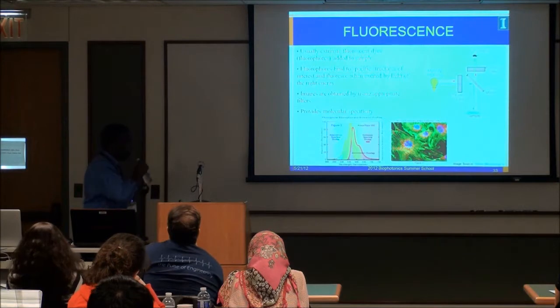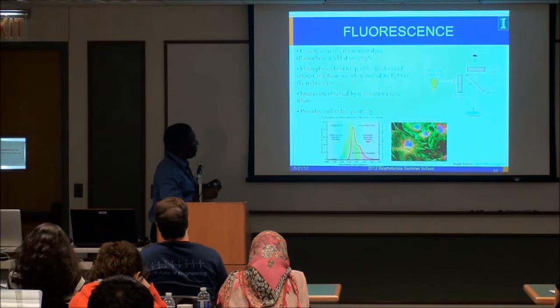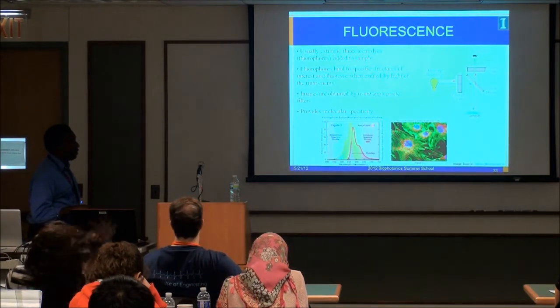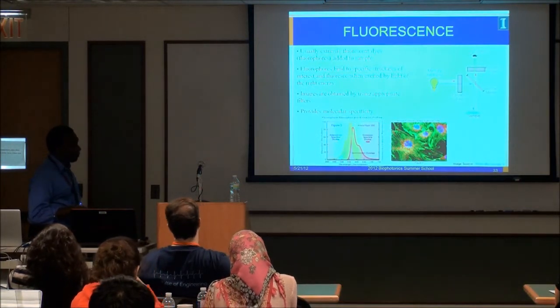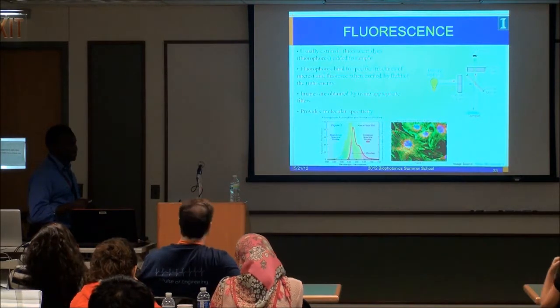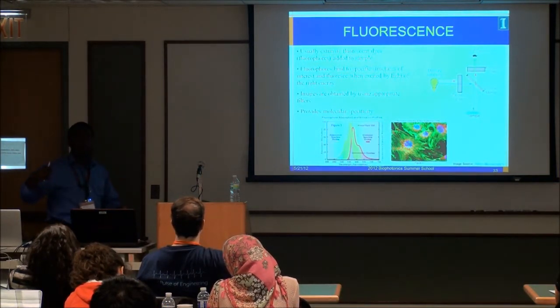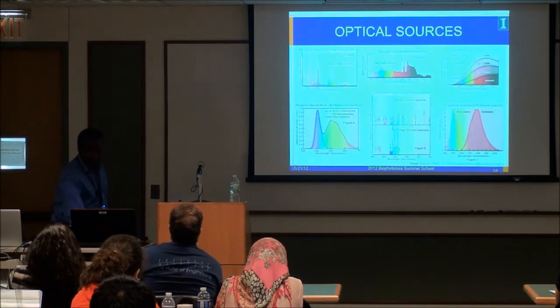So fluorescence microscopy is what typically gets used. I think everyone is pretty familiar with that, because I talked about it from the quantum picture. But you can imagine there are different fluorophores that one can use. They have a certain absorption spectrum, they have an emission spectrum. Typically you come in with energy that matches the excitation bandwidth of the absorption spectrum of what you're trying to excite. And the light that's coming off will be Stokes shifted because it's lost energy. And so you're going to have an emission spectrum profile to that.